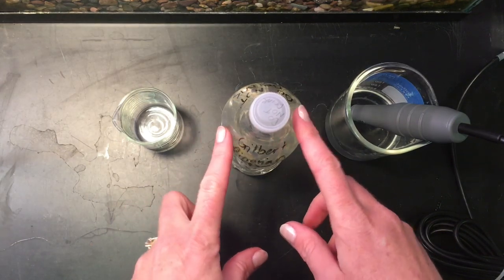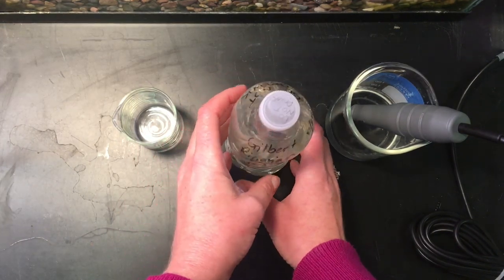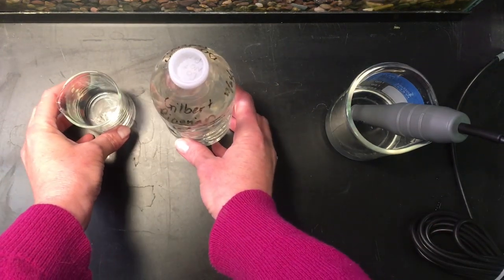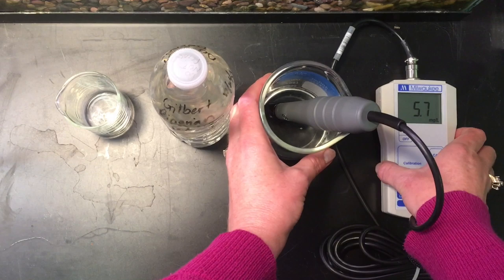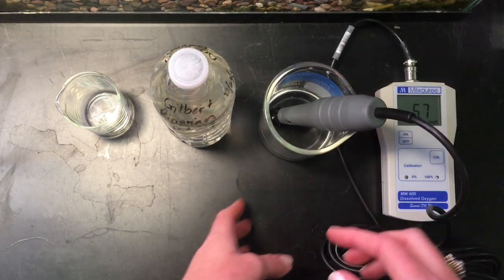Here we have our water sample from the Gilbert Riparian Preserve, one of the ponds. And now we're going to check the dissolved oxygen of it after it's been a few days. So we have our dissolved oxygen probe here in distilled water warming up.